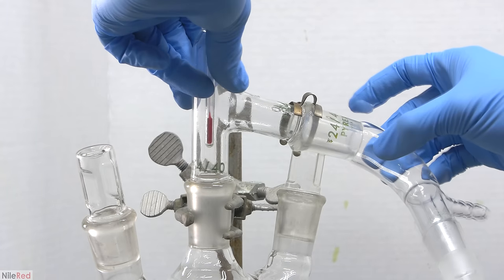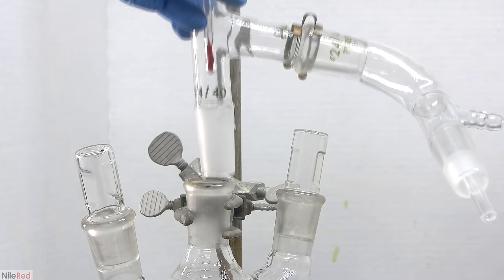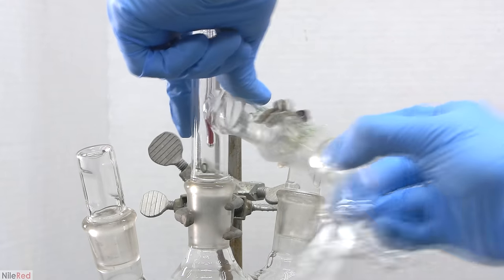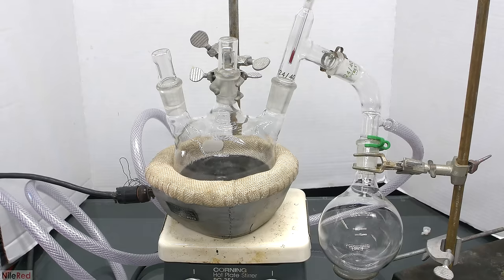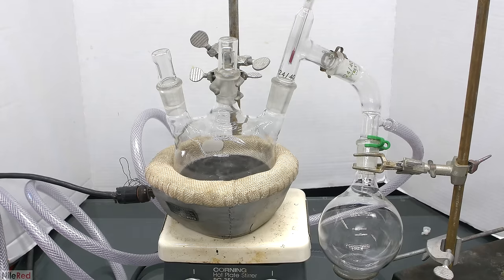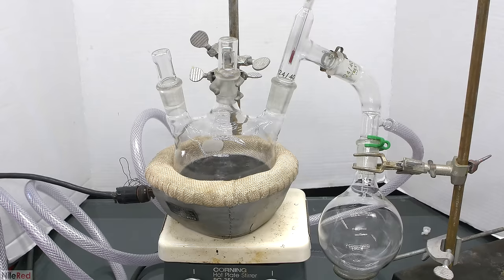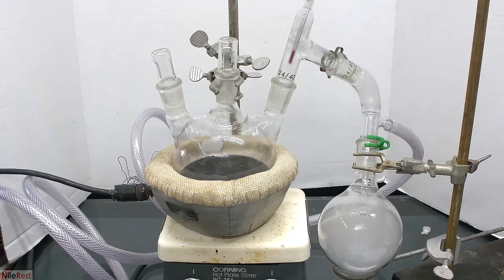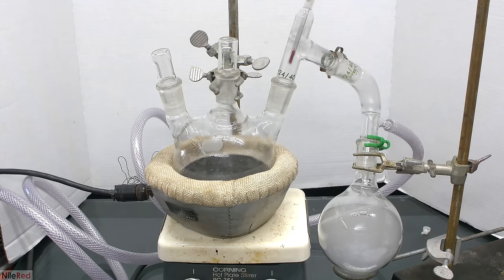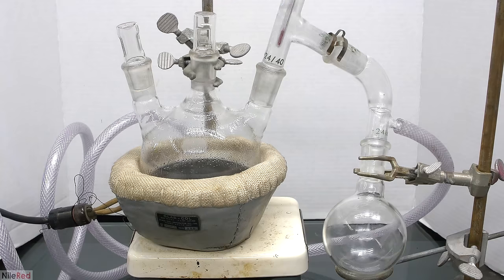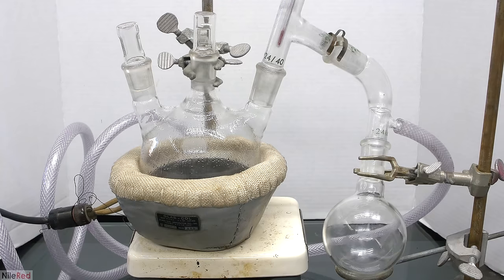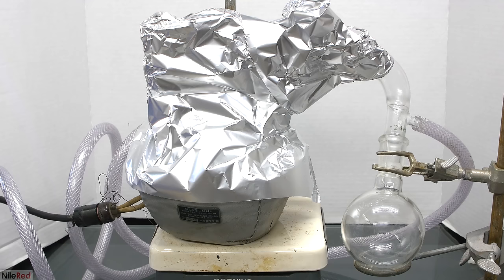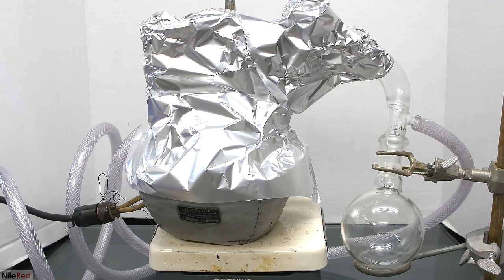The next thing we need to do is vacuum distill the aluminum isopropoxide. Before we do this, every joint has to be greased, and we can't use a condenser because the aluminum isopropoxide would freeze in it. When everything looks good, I start the distillation by turning on the vacuum and heating. The reaction mixture is still hot from before, so it's important that the vacuum is turned on slowly. What initially comes over is leftover isopropanol, which can be discarded. The receiving flask was changed out, and now with all the isopropyl alcohol gone, we can start to collect our aluminum isopropoxide. To keep the apparatus hot and help things come over, I insulated it with aluminum foil.